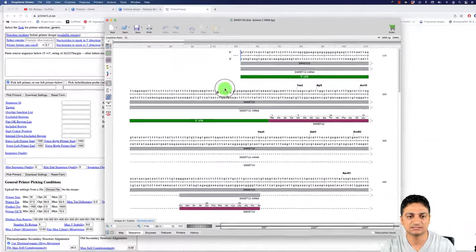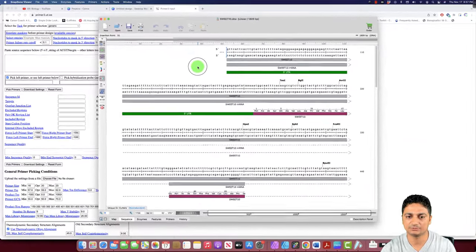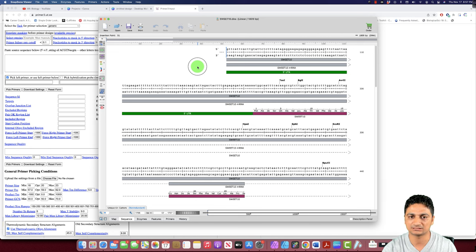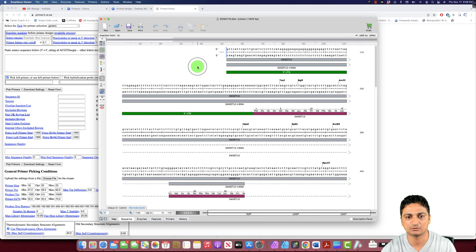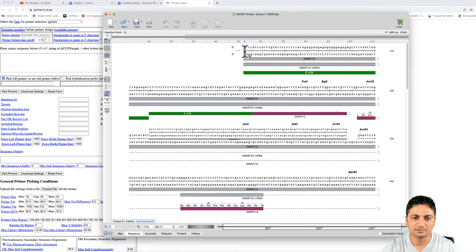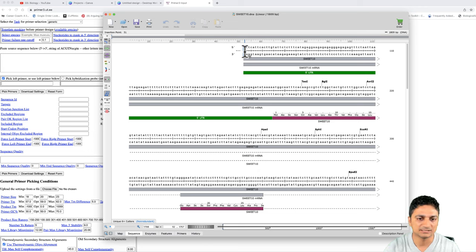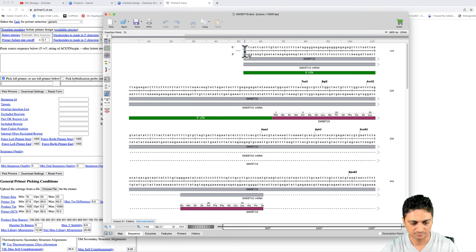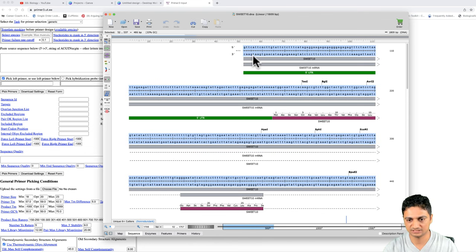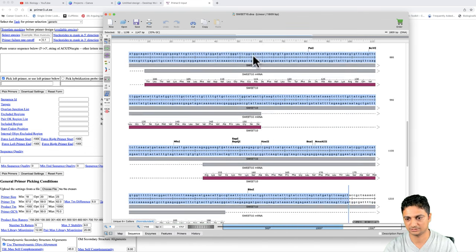This is the gene that we were working on in the last lecture, the second lecture, where we downloaded this gene, sweet gene from NCBI from the crop Arabidopsis. Let's copy this all sequence.